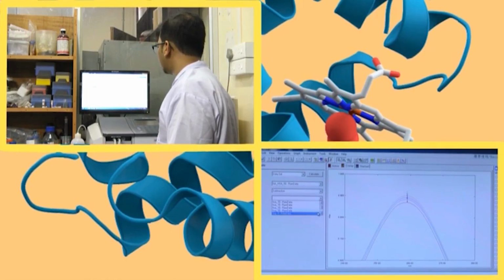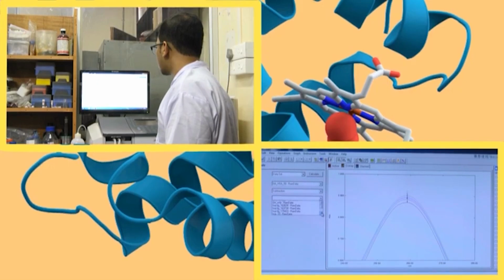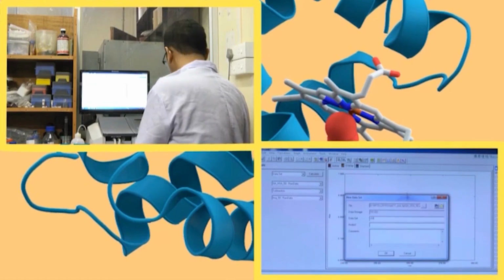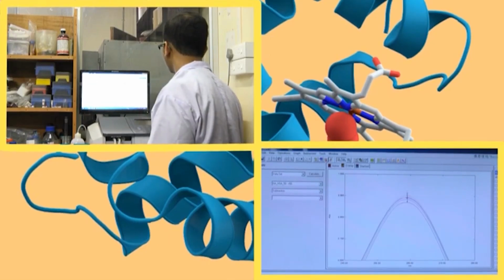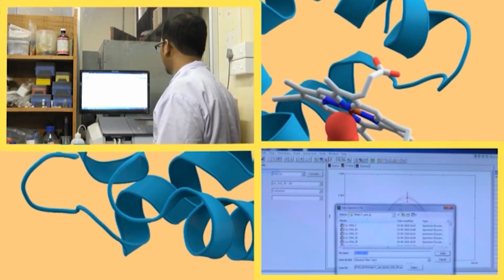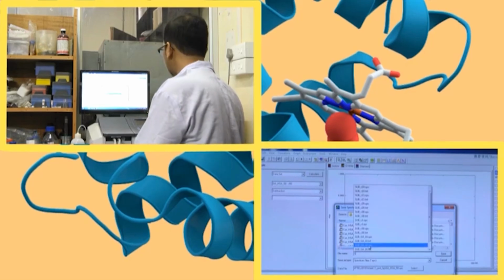Where is it? HSA 50. Well, it again increased a bit. Save as, yes.